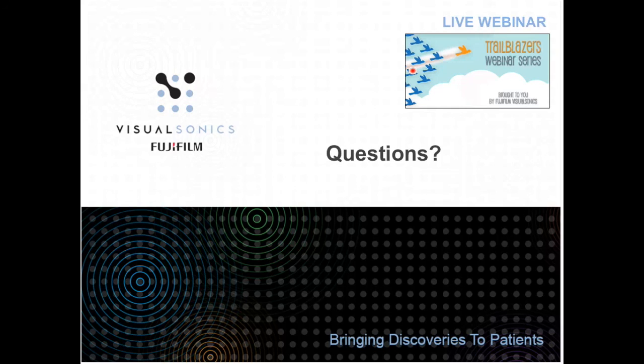Yeah, that's exactly true. So let's say you're unable to characterize your contrast agent in vitro, and I've done this before, even if I have done it in vitro, put it in vivo, it changes. But because I can see it, and because I can image across the whole wavelength range, I can actually characterize it in vivo. I can find a little spot where I can see the contrast agent, characterize the curve there, and then use that to do the unmixing. And that's a good point, Andrew, thanks.